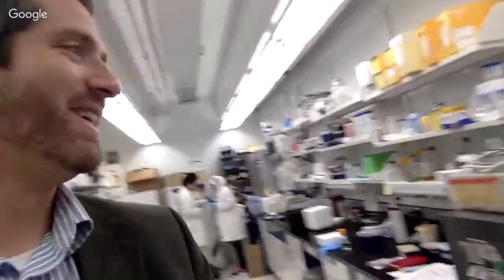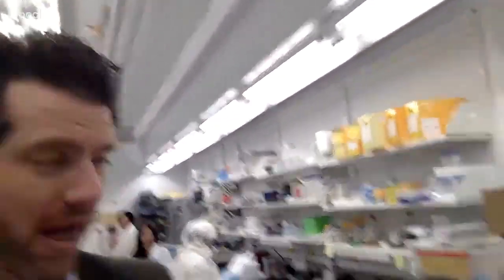Everyone's throwing on their lab coats. We are here, just two stops left on our Giving Tuesday journey through BTI. We've made our way down to the first level of BTI where we are in the Jander Lab and we're going to learn all about the work they're doing here.